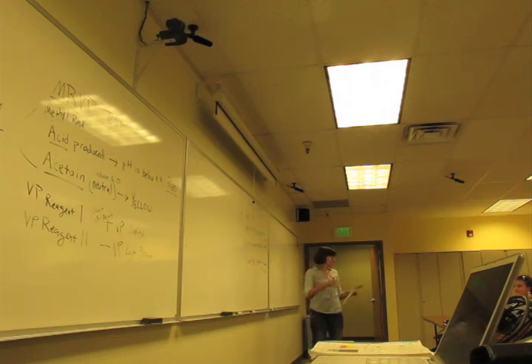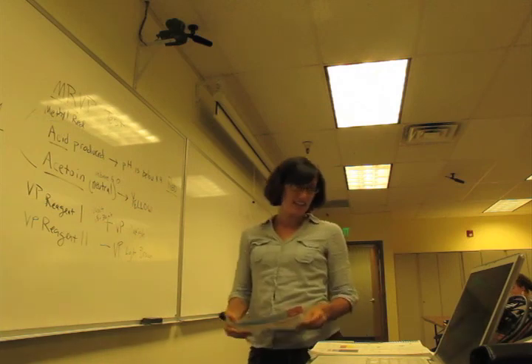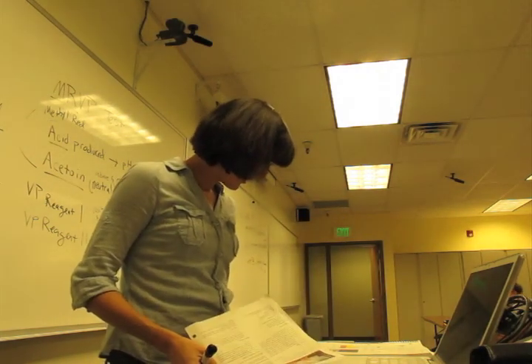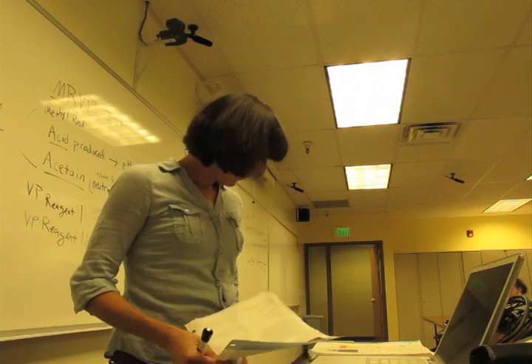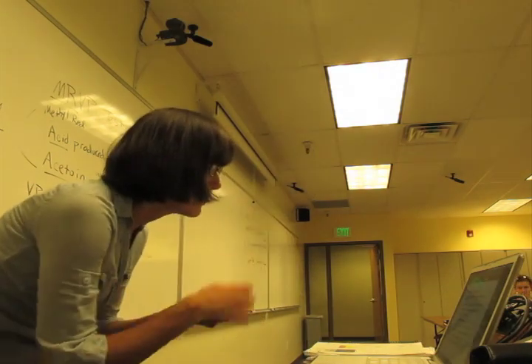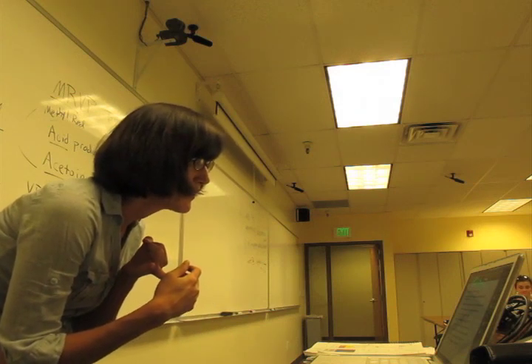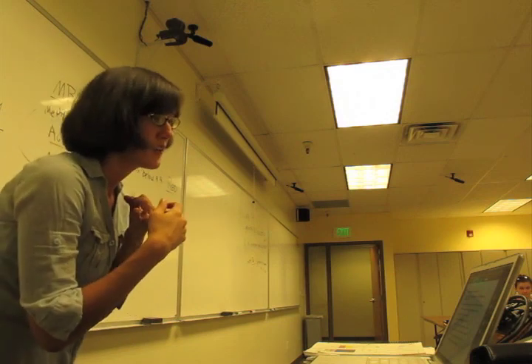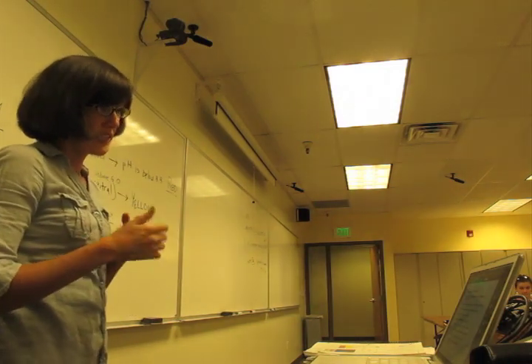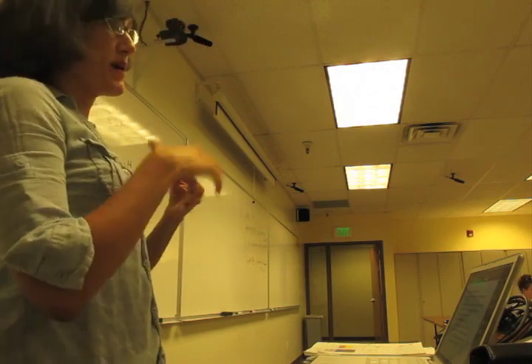The indicator turns from green to blue when it is alkalized, so that indicates a positive citrate test. That one's a little easier than the other two. So know what color each test begins and what color it turns depending on whether it's a positive or negative test, and know why it changes color. It usually depends on the pH because of the byproducts produced.